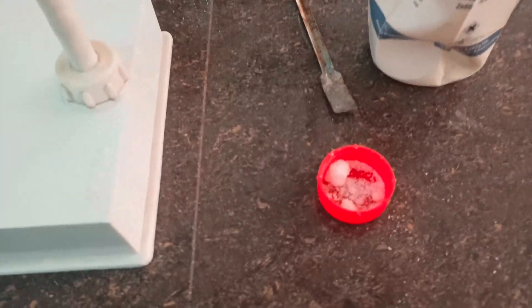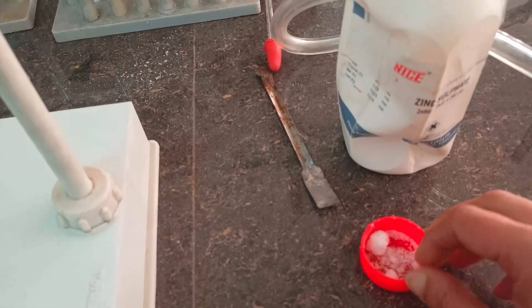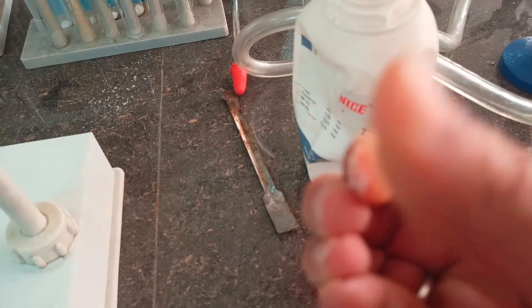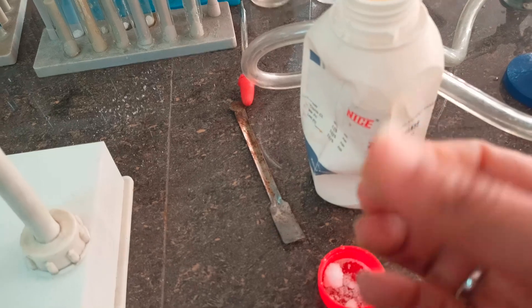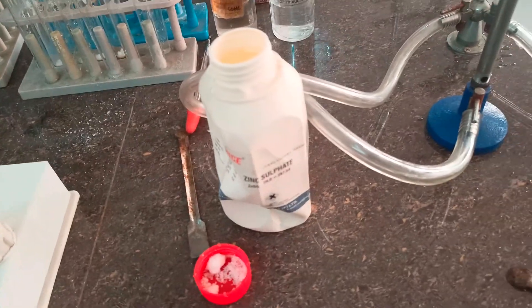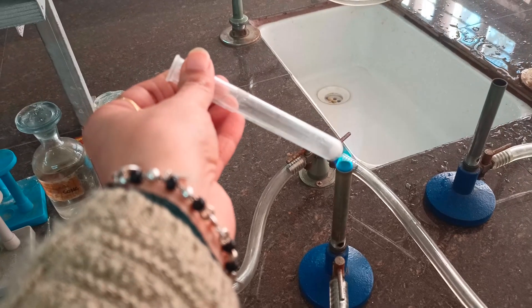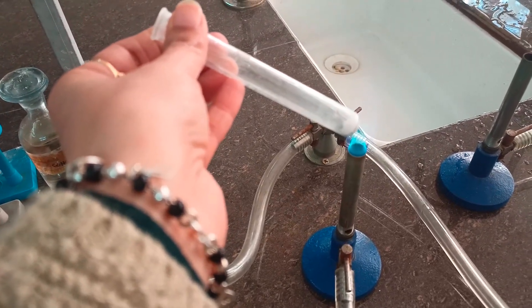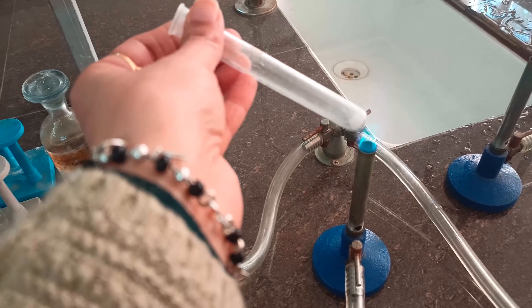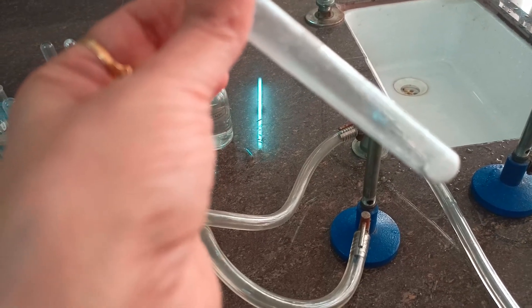The first step is the preliminary test. We will check the color, moisten your finger, and check the smell — vinegar-like smell indicates acetate, ammoniacal smell can also be detected. In this salt, no specific smell is coming. For the dry heating test, I have taken a pinch of salt in a dry test tube and going to heat it. You can see some noises and the salt begins to fuse, meaning this salt is a hydrated salt. No specific smell means ammonium, acetate, and chloride are absent.